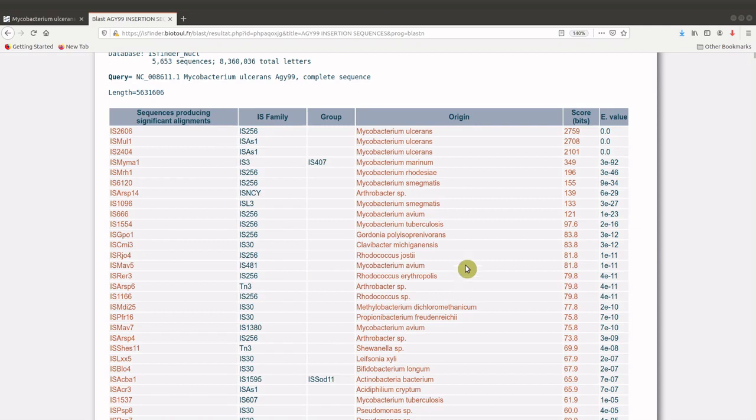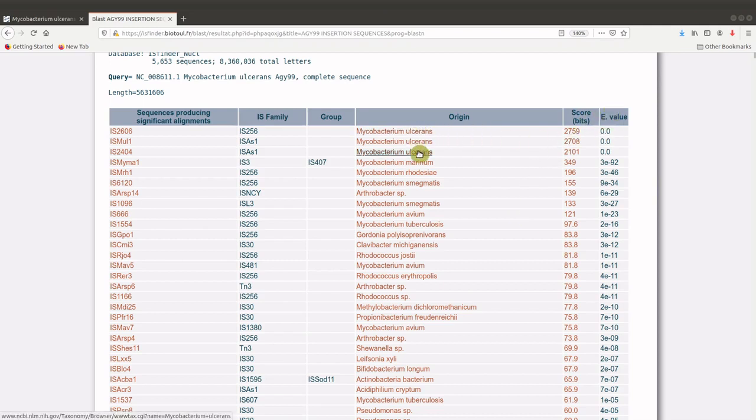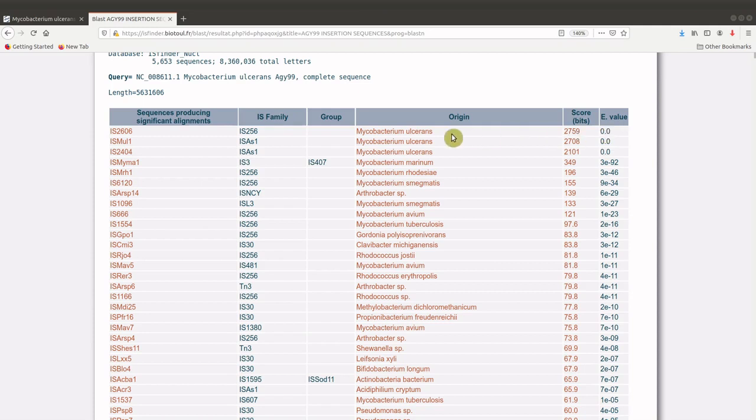And we also have the e-value here. So combining the origin and the e-value, you could be able to get the right results. If you look at the e-value for these three, which are also for Mycobacterium ulcerans, they have the lowest e-value, which is 0.0. And in the BLAST search, the lower the e-value, the more reliable the result is, generally speaking. So this gives us three insertion sequences for the Mycobacterium ulcerans sequence that we used.